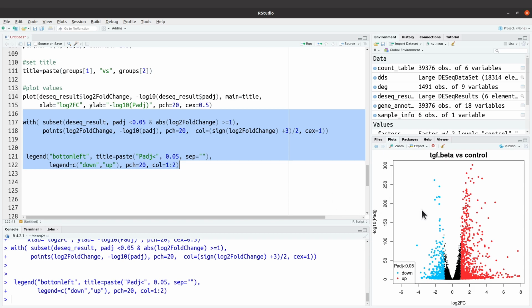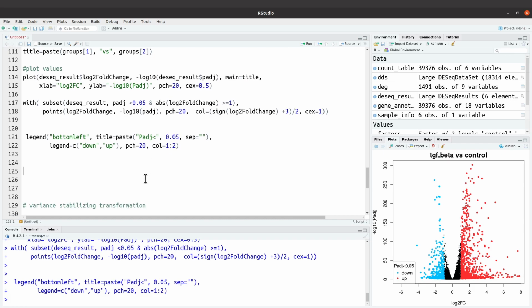So you can also save your plots. So when you go to right click, you can go to save images. But you can also save using an internal arrow here. You can specify some codes here to save it automatically. All right. So just save it. If you have any issues with saving, you can always contact me and then we can have a session. So this becomes the Volcano plot. All right, now let's move on.